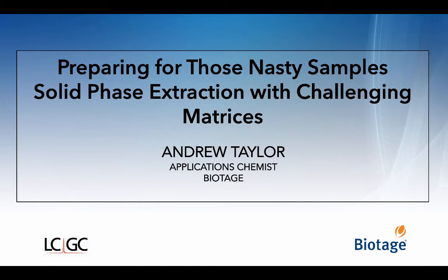The first thing that I would do is stop the flow through the disc of that clogged filter, and then I could set up another disc holder on another station and pack it with the proper amount of pre-filter material, and extract the remaining sample on another station. Now, when you do this, you need to combine both the extracts that you get at the end to make sure that all the extracted material is accounted for.